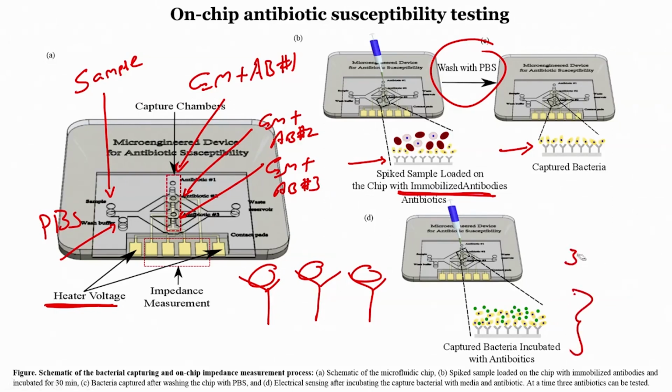We can incubate for 1 hour as well, depending on what kind of bacteria we have. Suppose we have E. coli, the doubling time is 30 minutes.